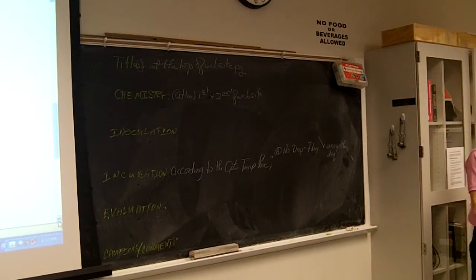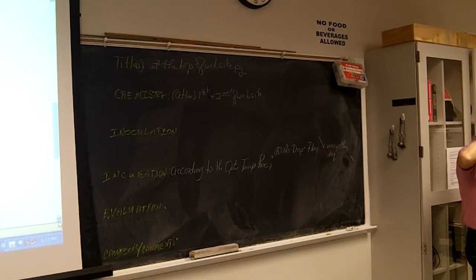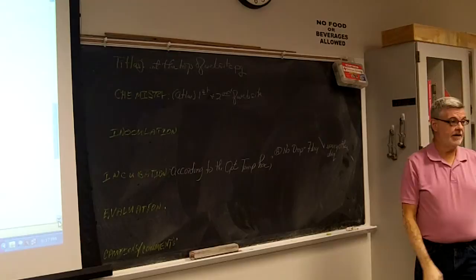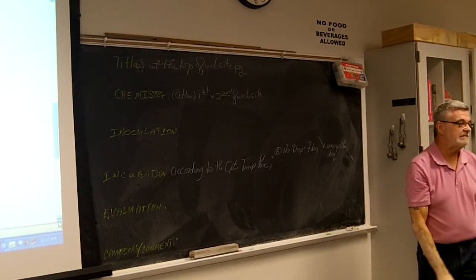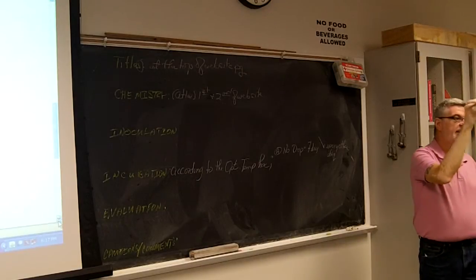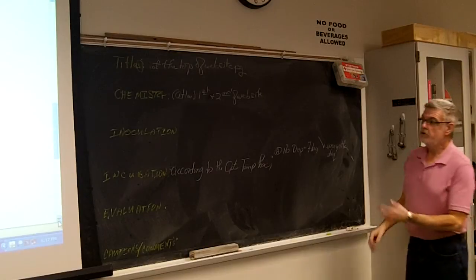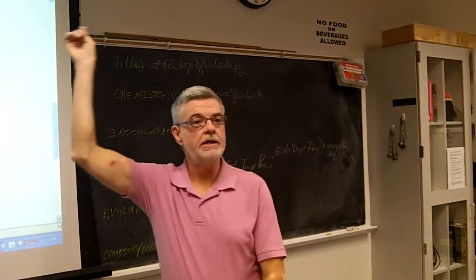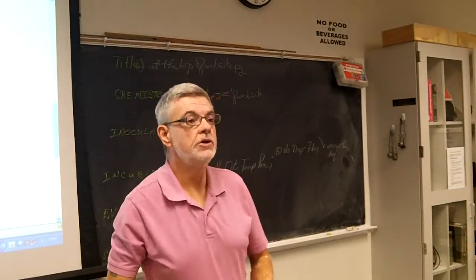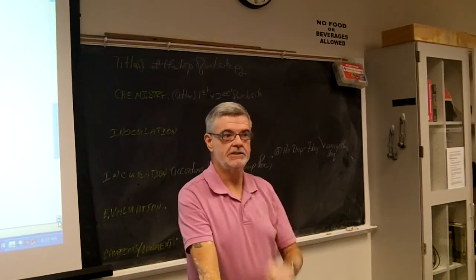That's why after our midterm, we meet every Friday and Saturday, because if you did your experiment, you'll be checking it on Friday and Saturday, or you have your lab partner mix and check it. Would you please go and mix and check my paper? Oh God, that's too hard. That takes 10 seconds. So you come back on Friday or Saturday and you mix it and you hold it up against white paper. If it's yellow, you write down moderately fast positive, because that's the second time you've checked it.